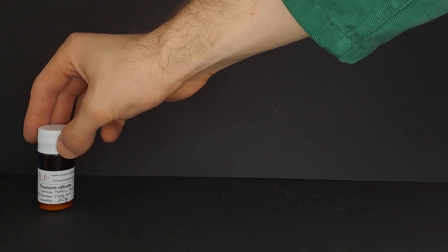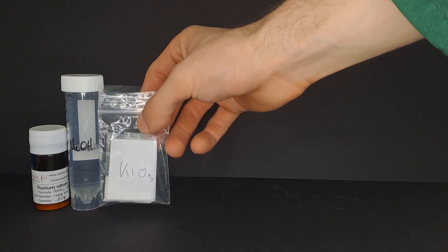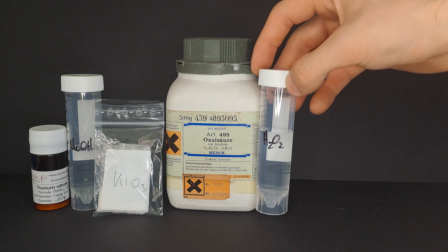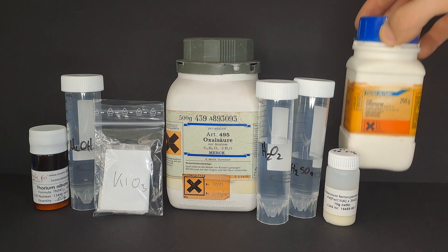Here are the chemicals we need. Thorium nitrate, sodium hydroxide, potassium iodate, oxalic acid, hydrogen peroxide, sulfuric acid, potassium hexacyanophariate 2 and potassium chromate.